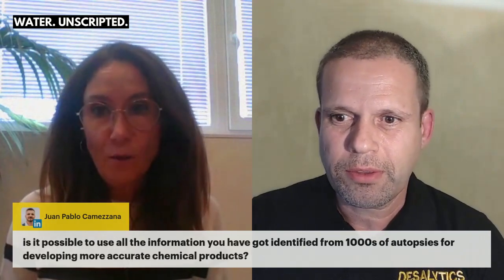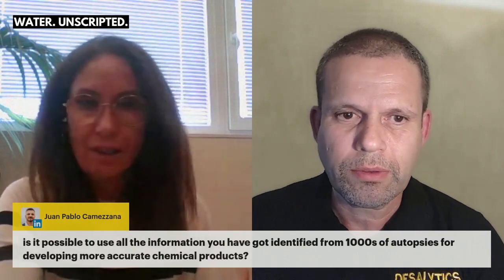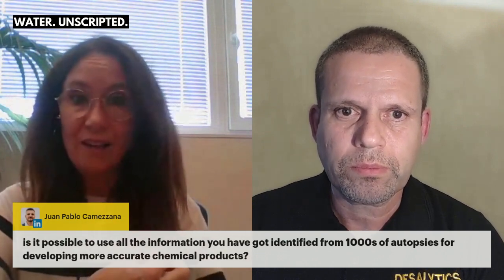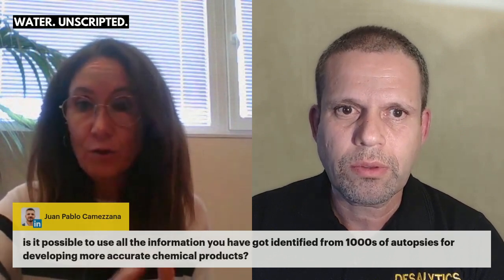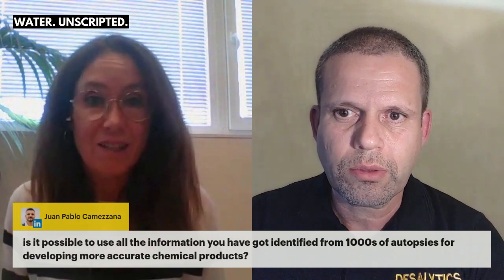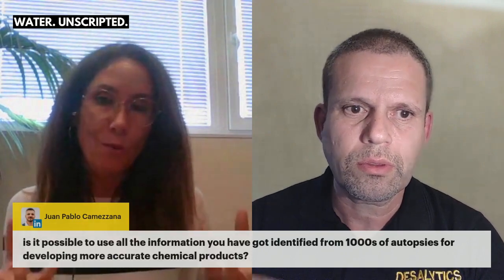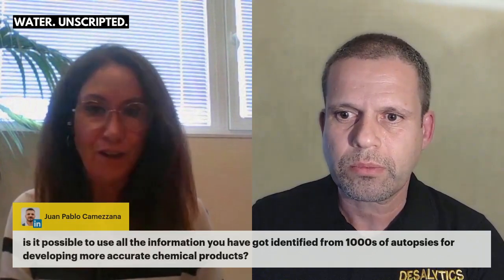Yeah, sure. Actually, it's the way to do it. We always check, for example, the cleaners we develop during autopsies. At least in our company, when we start selling chemicals or cleaners, we have already tested them on real foulants. And we use this information because from all this data, we already have some statistics about which is the most common foulant, which is the most common mixture of foulant components, etc. So yeah, for sure, data from autopsies are a very good tool to develop cleaning procedures, cleaners, etc.